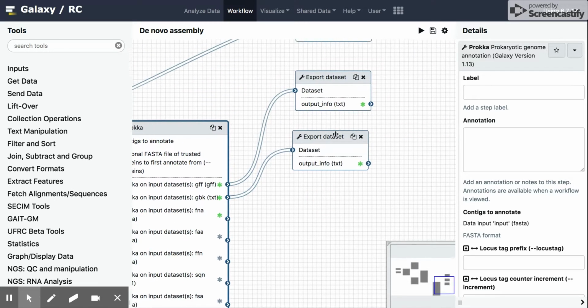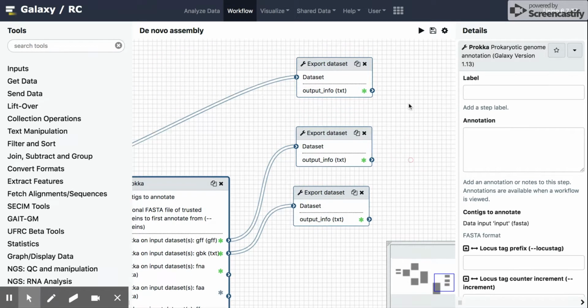So I trailed off at the end with these export data sets, which I'll show once we introduce how to access your storage drives on Hypergator using something like WinSCP or FileZilla, depending on the platform, either Microsoft or Mac OS X that you're using. I'm on a Mac, so I use FileZilla to access the server and navigate my way through the file system just like I would on a Windows Explorer, for example.